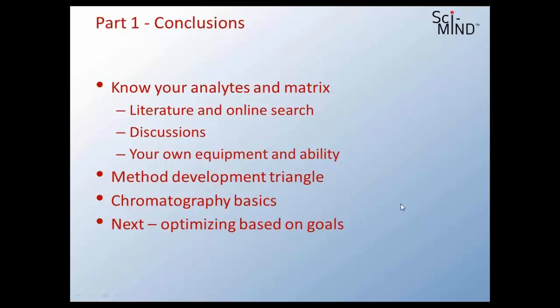I'm not sure that I agree that they're always outdated, but I do agree that we can always improve them by incorporating either current technology or technology that we have in our labs that, of course, is different from whomever published that method. I'm not sure I completely agree that all literature methods are outdated because we're much quicker today about publishing than we used to be. If you're addressing cost effectiveness, some degree of optimization will always be worthwhile, and you bet.